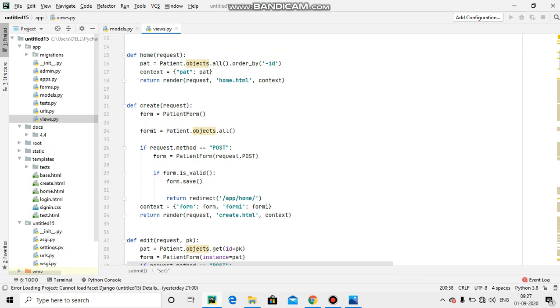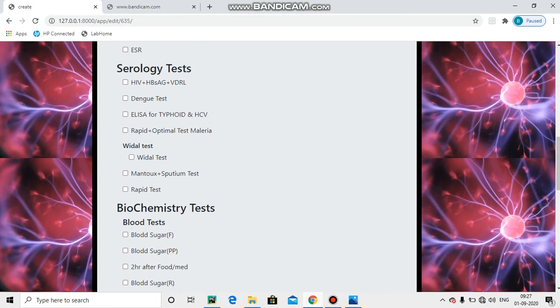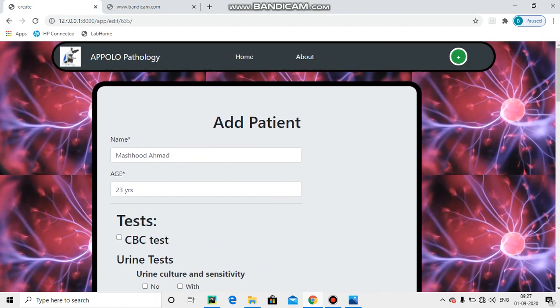First I want to tell you that the whole software is designed in the Python language, and the framework is Django. Now I will start to show you. I completed this project and submitted it on the local server. The advantage is that if there is no internet, we can still run it on the local server for them.